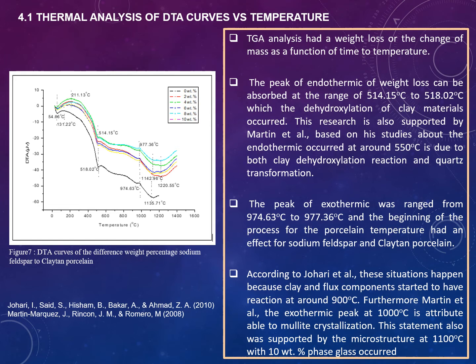This research is also supported by Martin, based on his study, which found that the endothermic peak at around 550 degrees is due to both the clay dehydroxylation reaction and quartz transformation.